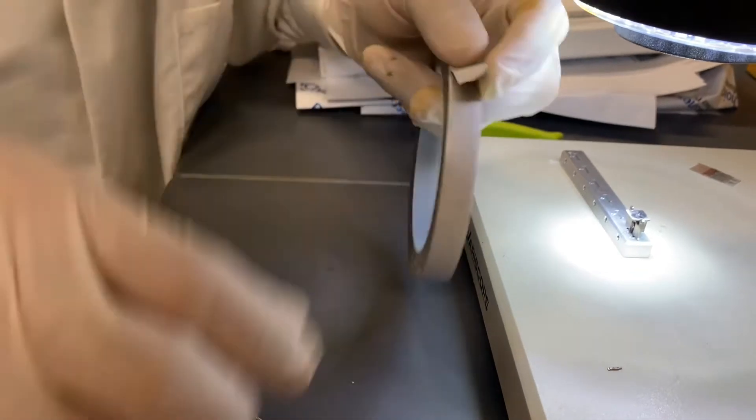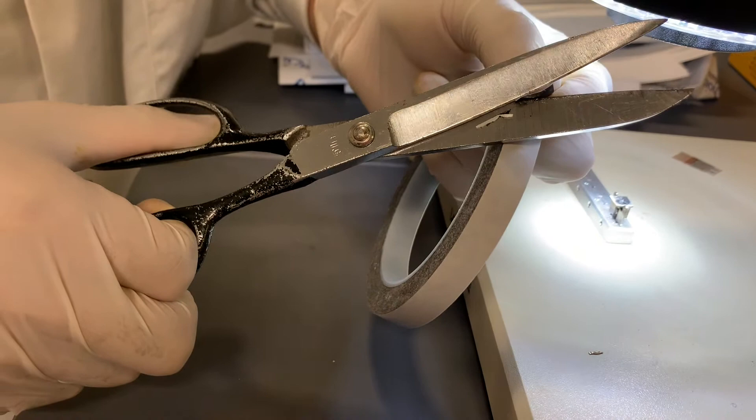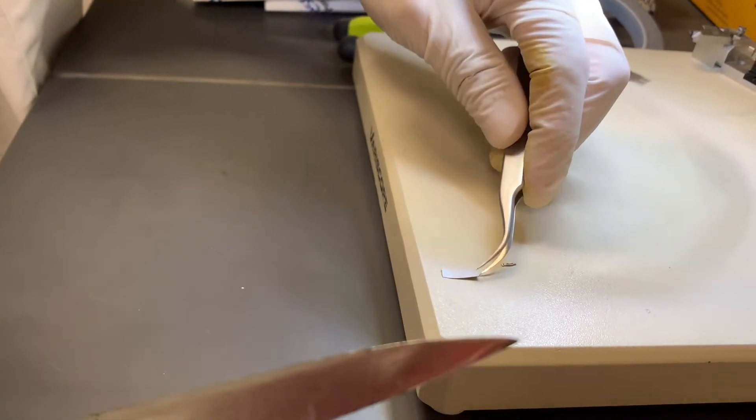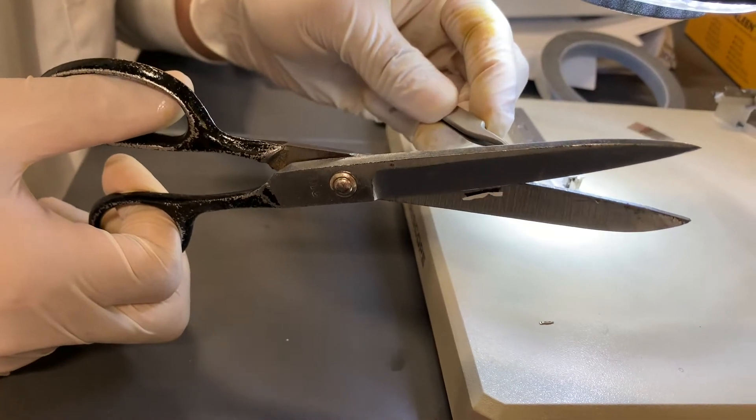Cut a piece of carbon tape. There are two lines on the surface of this sample holder and the cross section is the center. Paste the carbon tape along one line.